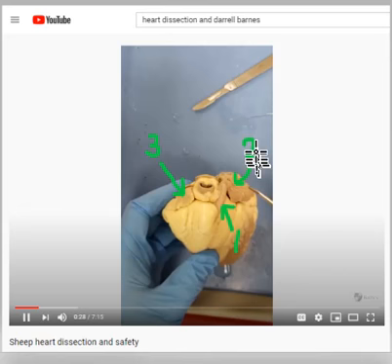I want you to number one, two, and three below the video and tell me the features that you see. This first feature comes up out of the heart. It carries blood to the lungs for oxygenation. We're looking at the front of the heart here, so this is the left and this is the right.